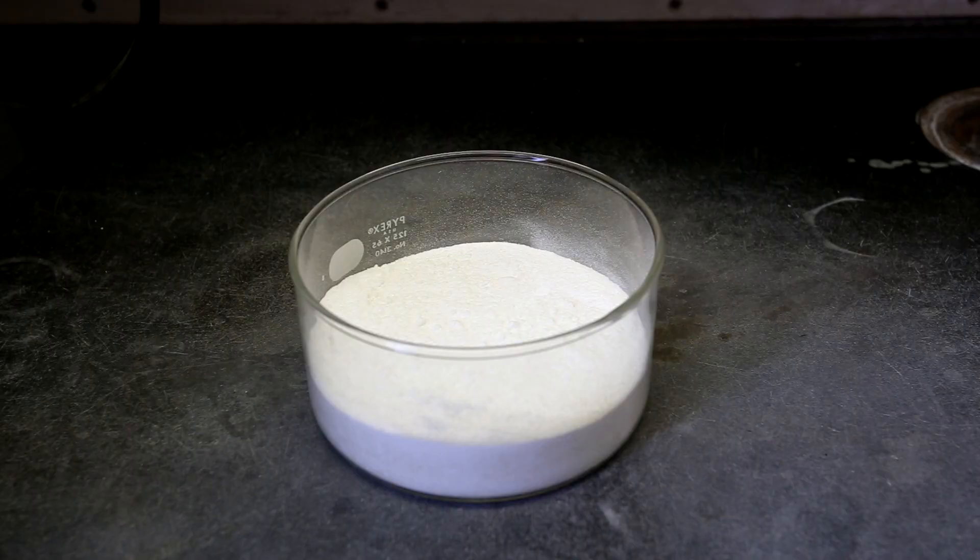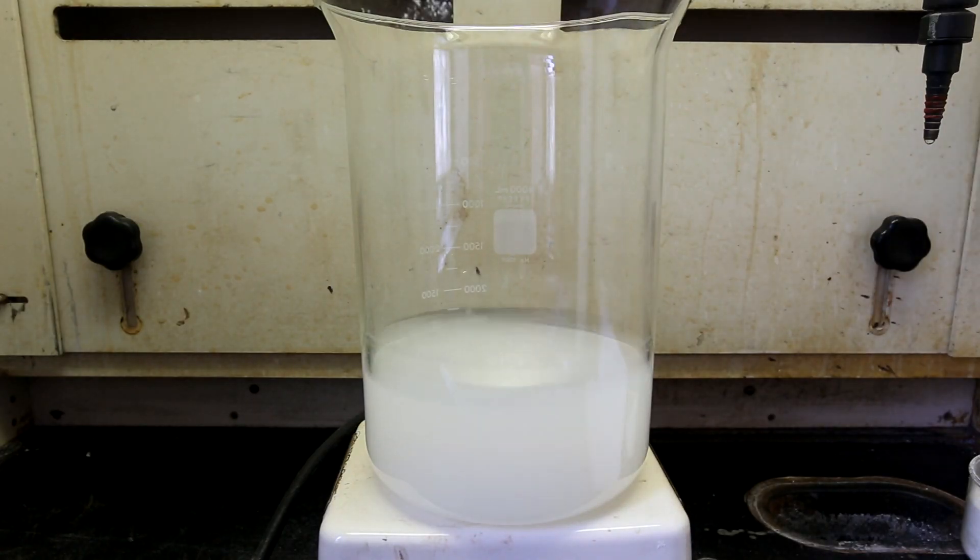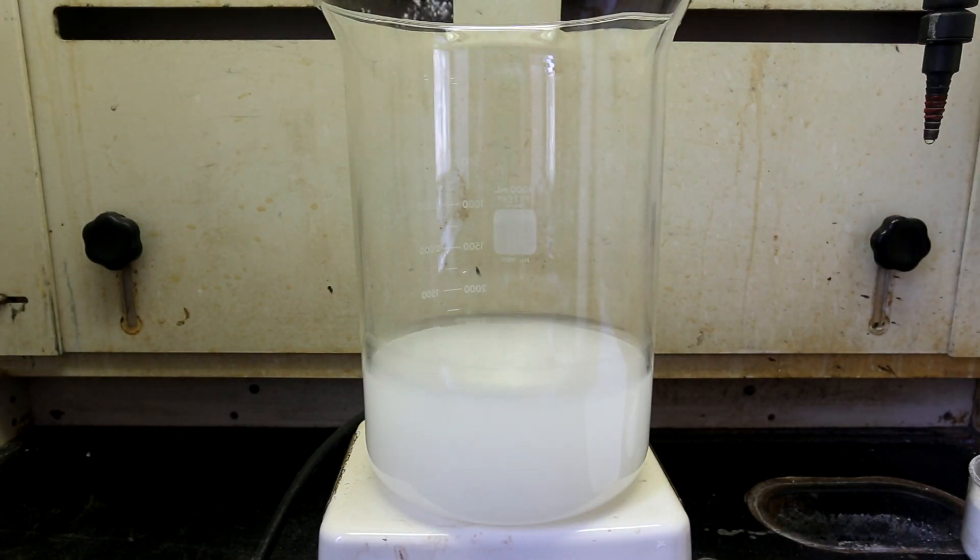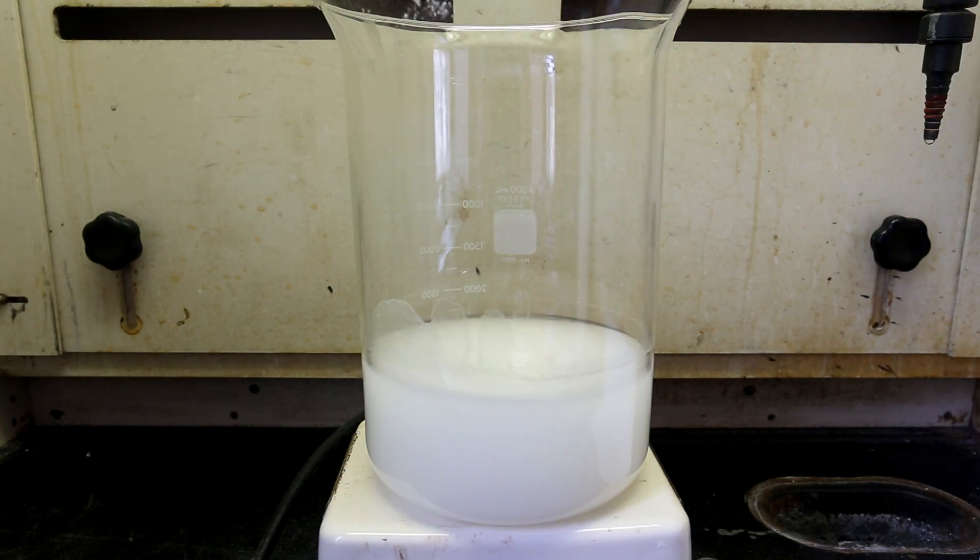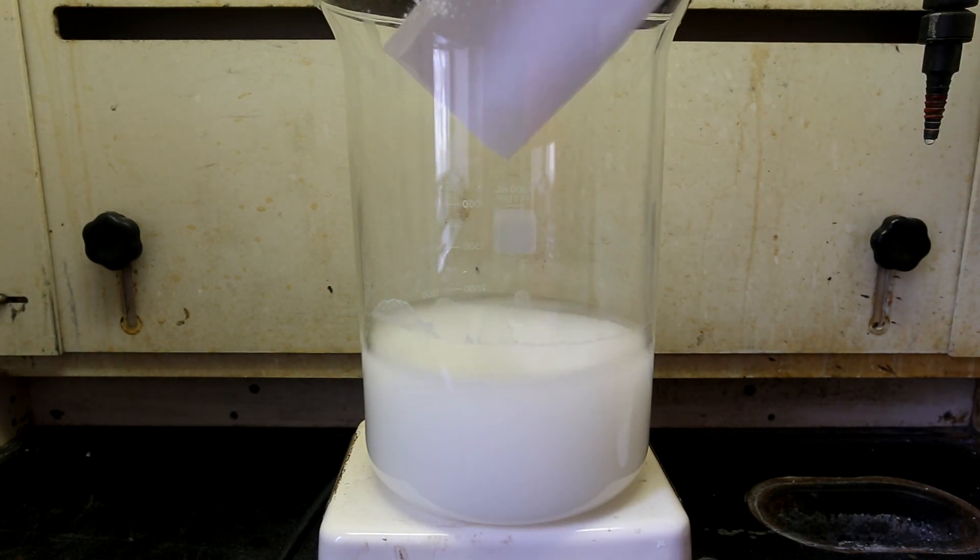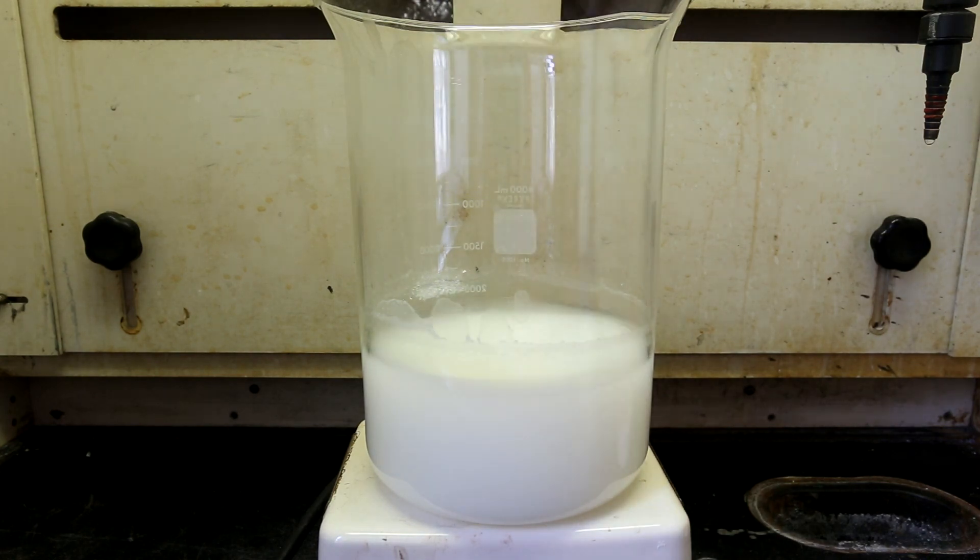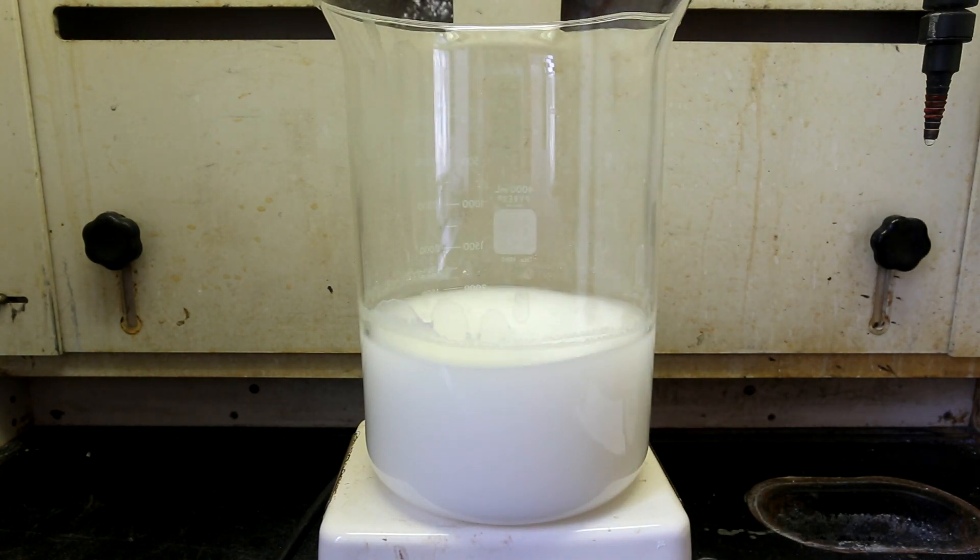This is what the final powderized 500 tablets looked like. I then dissolved all of the crushed up aspirin in about 1 liter of acetone. You could easily replace the acetone with methanol or ethanol. I added the aspirin powder slowly to avoid jamming the stir bar with excess undissolved powder.